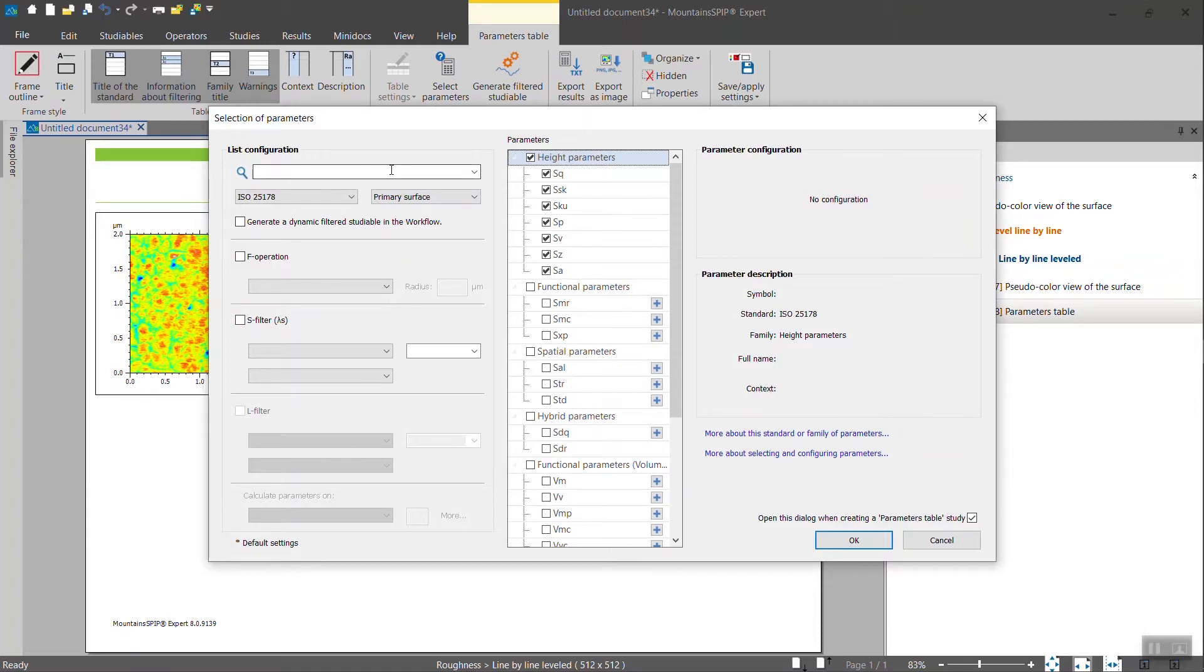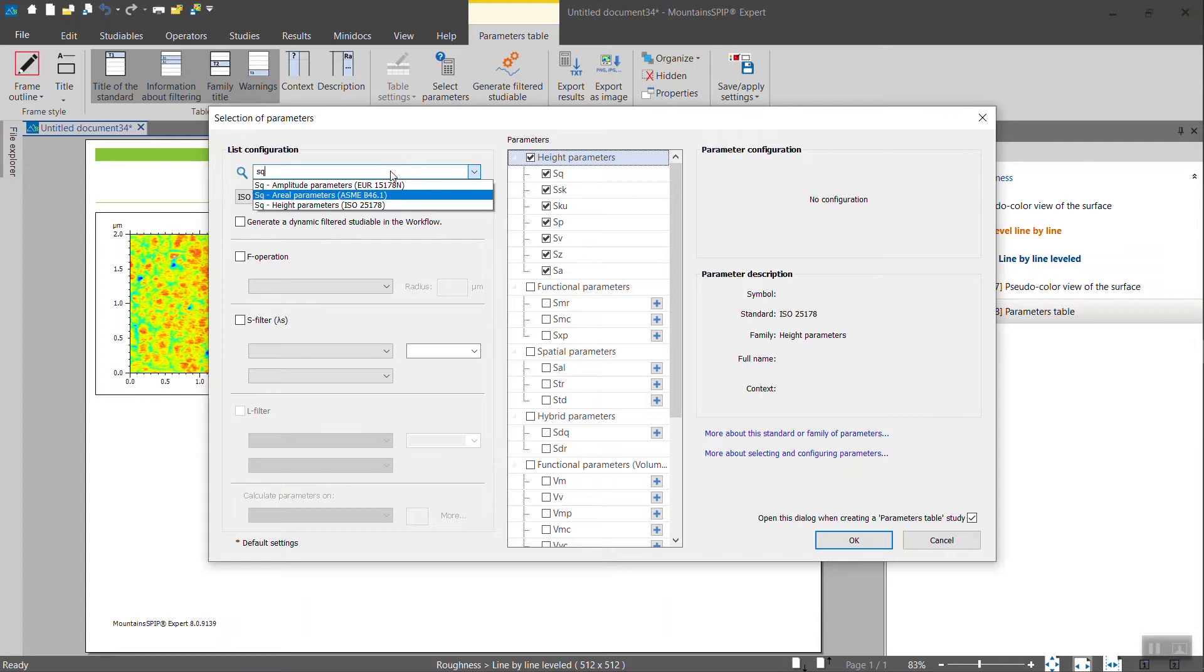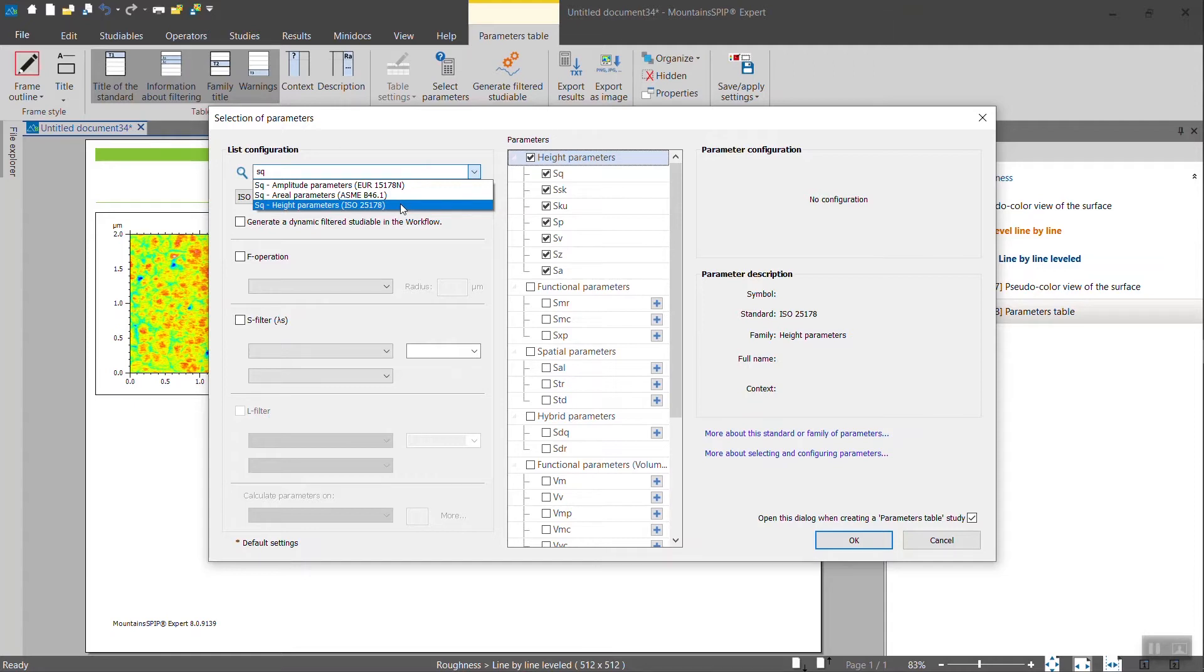If you want to look for specific parameters, you just have to find it here. For instance, the SQ parameter. And you will have three different definitions. So let's pick the latest one, which is the ISO 25178.